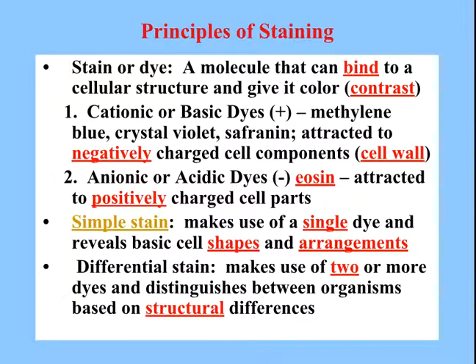Today we're going to talk about staining. What we're doing is trying to make the bacteria stand out against the background. So we're putting a dye onto something in the cellular structure to give it contrast. We will use mostly basic dyes like methylene blue, crystal violet, safranin.